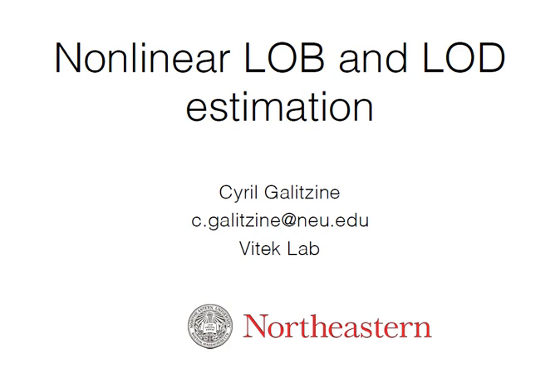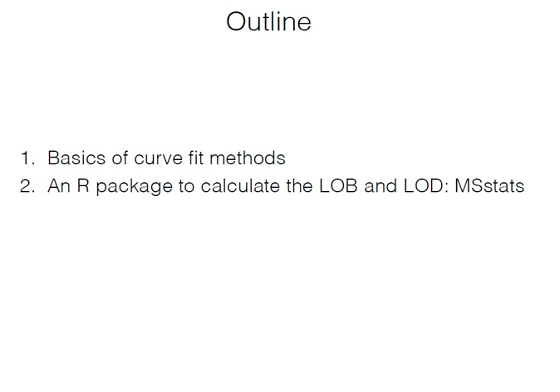Okay, so in my presentation today, I'll start by reviewing a little bit the definitions of the LOB, LOD, and then LOQ, and then I'll introduce the R package that we developed just to implement the method.